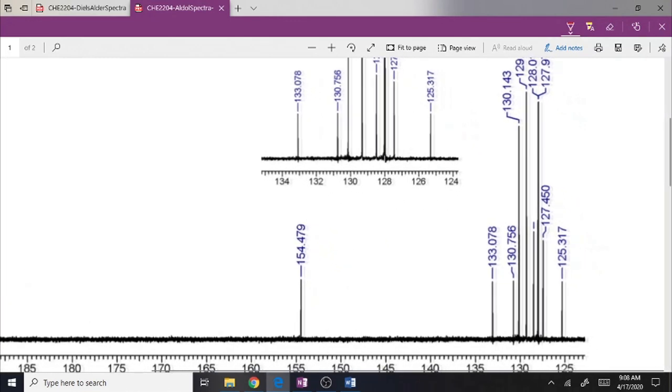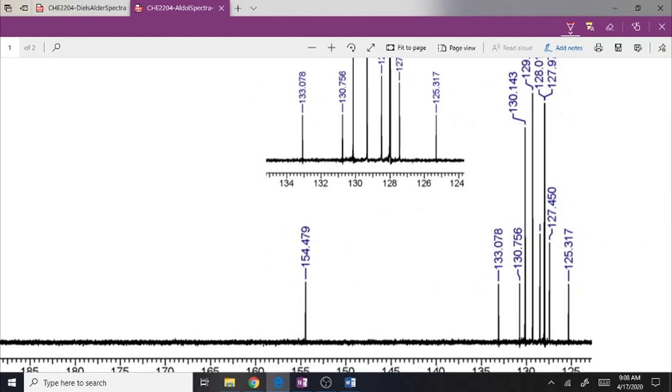And so when we are looking at our analysis of these peaks, to distinguish these, we look at essentially the height of the peaks. The shortest peaks are ones that have no hydrogens on them. So we have peaks here that all are very short, meaning these are C with 0 hydrogens, or if you prefer, no hydrogens on them. So you can do some analysis in that way.